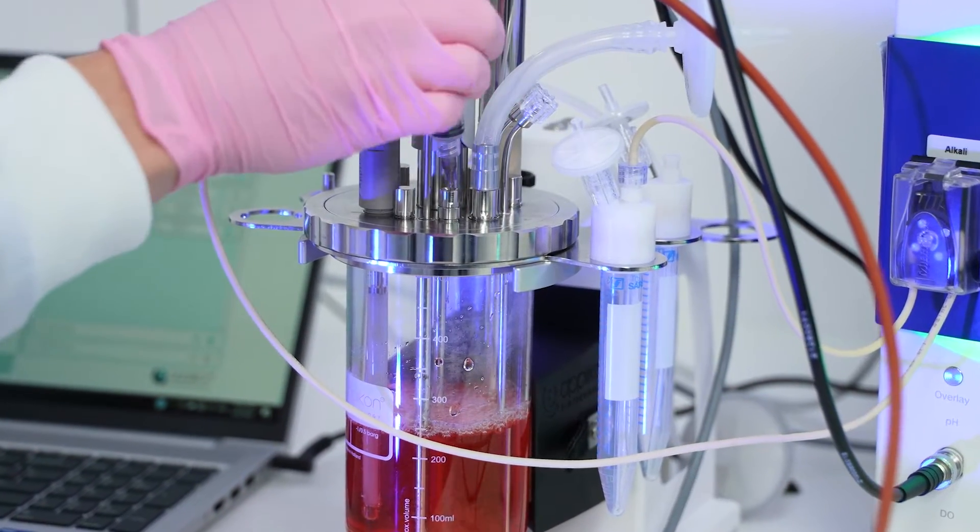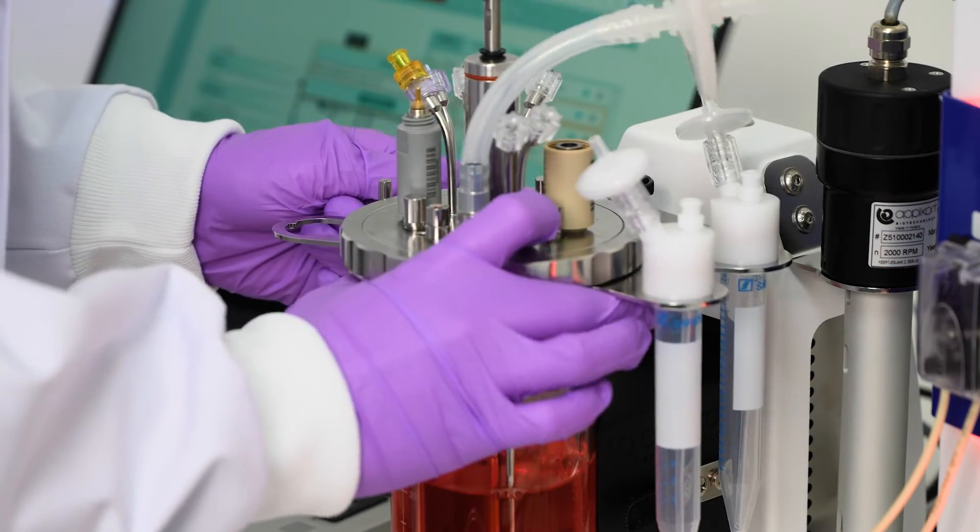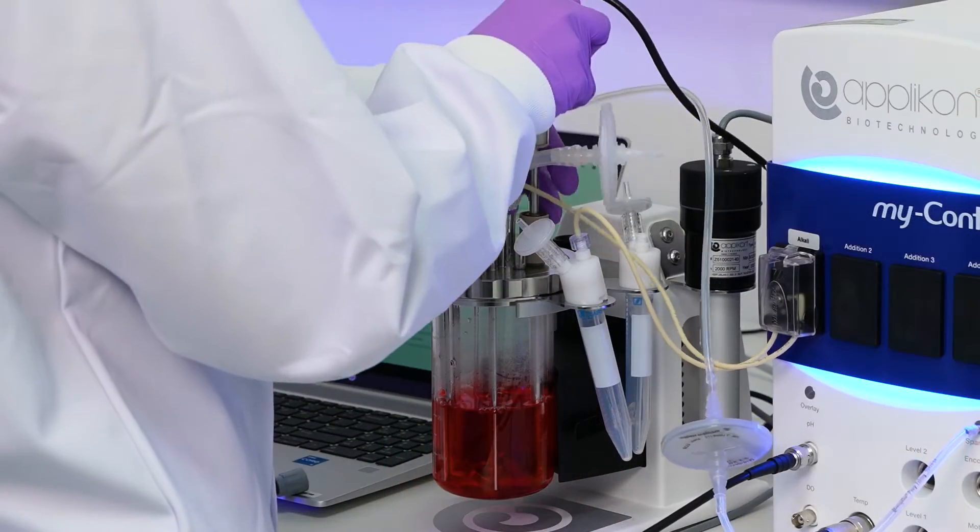This is important for us to mix the cells that are in suspension. It's very important that we can control all of the conditions: oxygen concentrations, the pH value of the media. We can also supply the right concentration of nutrients and carbon source, and basically control the environment to supply our fish cells with the perfect conditions for growth.